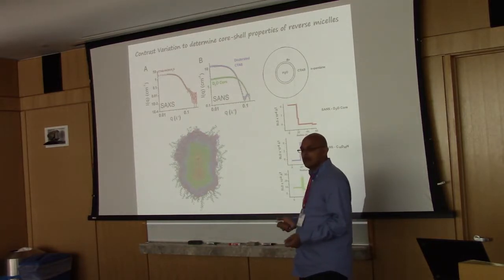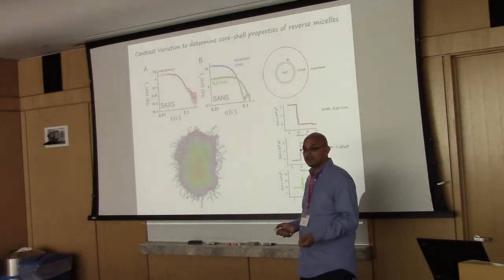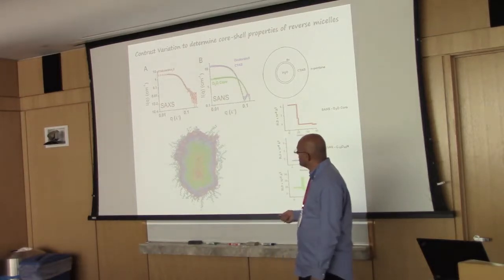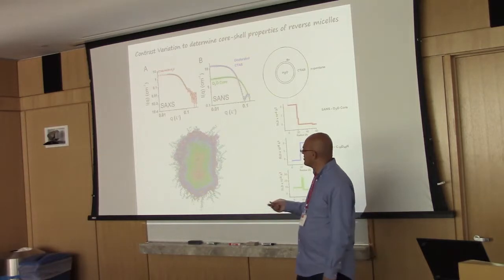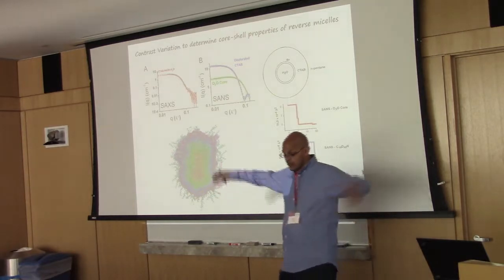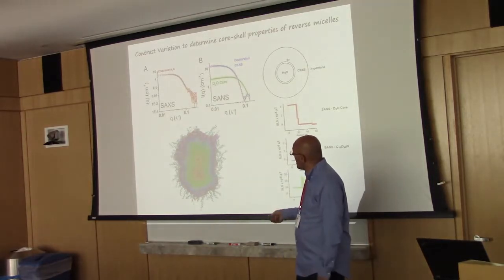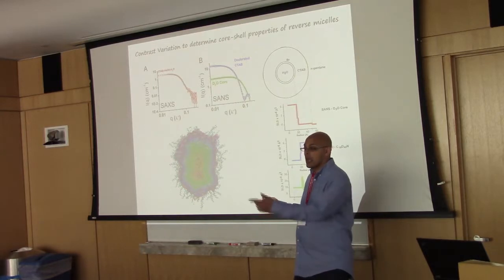However, in order to make those applications I just mentioned, you have to have a very good understanding of the nature of the micelle being created. And structural information is not readily accessible by most techniques. So what Kim did was he developed a very robust molecular dynamics simulation, 1-2 nanoseconds, of these molecules, assembling them basically from a distended state down into an assembled micelle, and then benchmarked the simulations using small angle scattering.